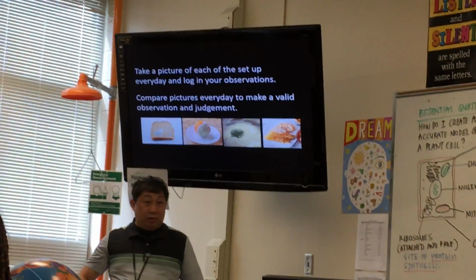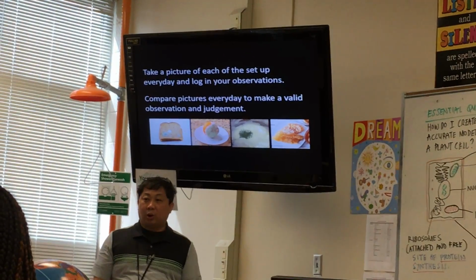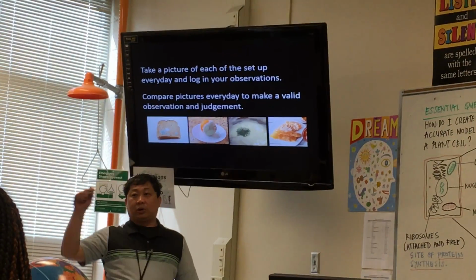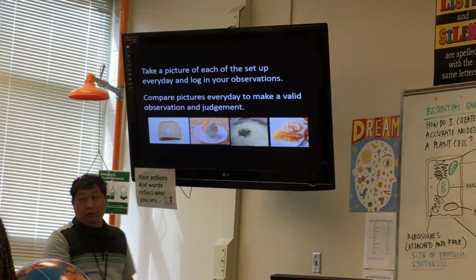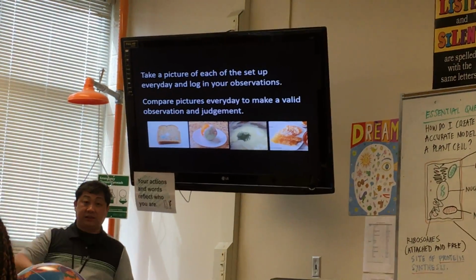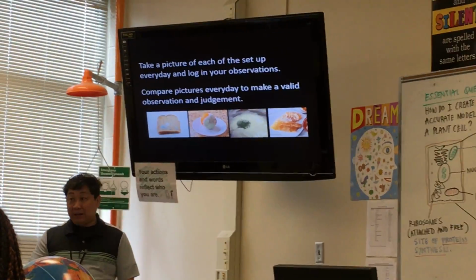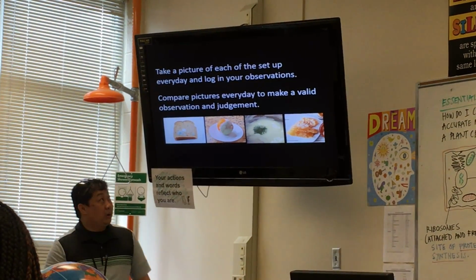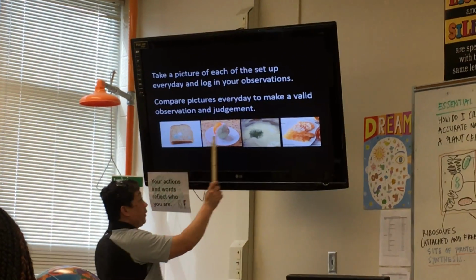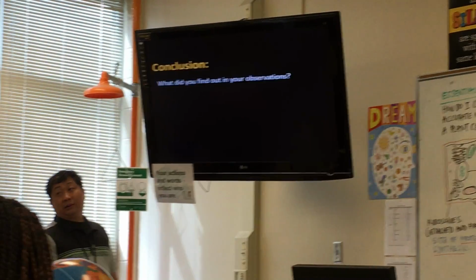Okay? So, I do not know what kind of species of mold will grow in ours. That depends on the kind of air that we have in the classroom. Sometimes the mold that grows are the black ones. Sometimes it's the cream. Sometimes it's the white one. So I don't know what kind of mold will grow here. But you'll know it's mold. Is that clear?